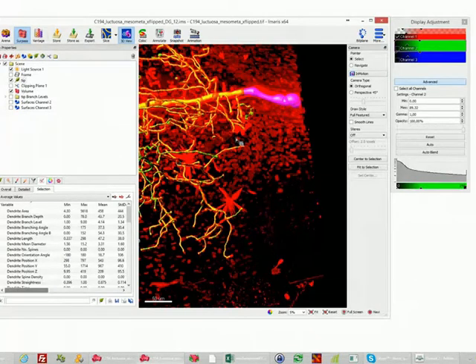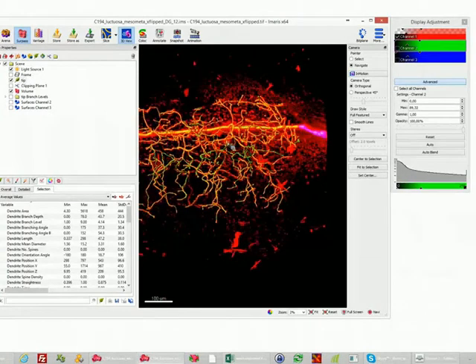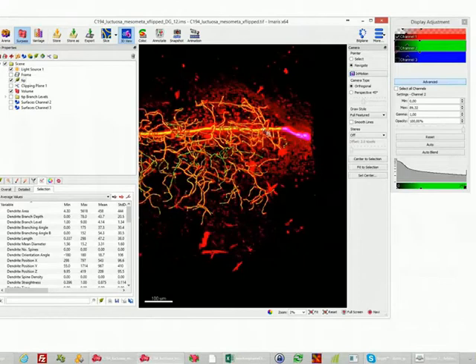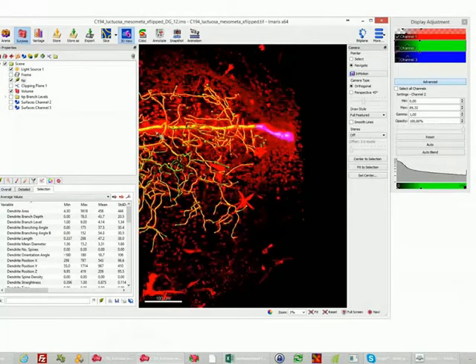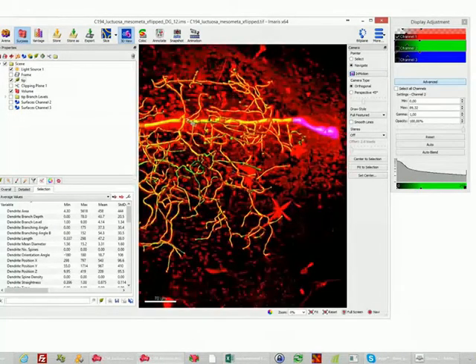One question which Trevor had about this data set was, how many main side branches do we have on the neuron? Here, this one is level 1, basically the big one, and then we have second level side branches, which are smaller ones, which go again through the tissue.